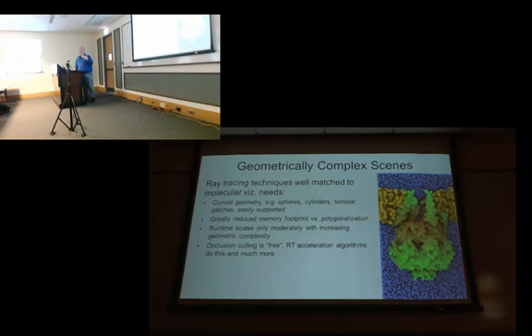And so there's a trade-off between performance and visual quality. The more triangles we draw, the smoother things look, the nicer the images. But that means it runs slower. So if you're trying to play a trajectory, you might use a very low resolution, and then it'll play faster, or it'll rotate faster. But then your spheres and your atomic representations look more like a stop sign and less like a sphere. So that's not a desirable outcome.